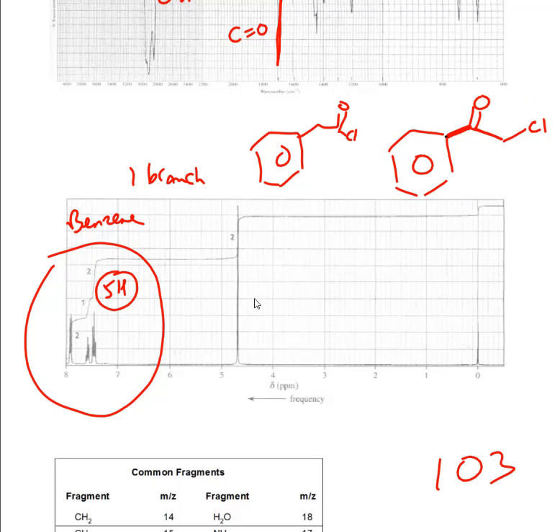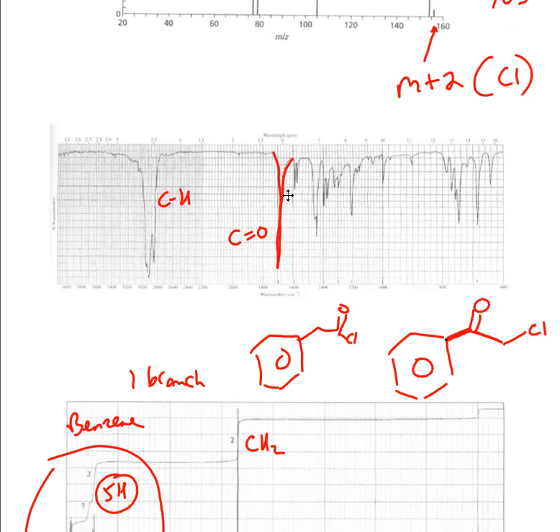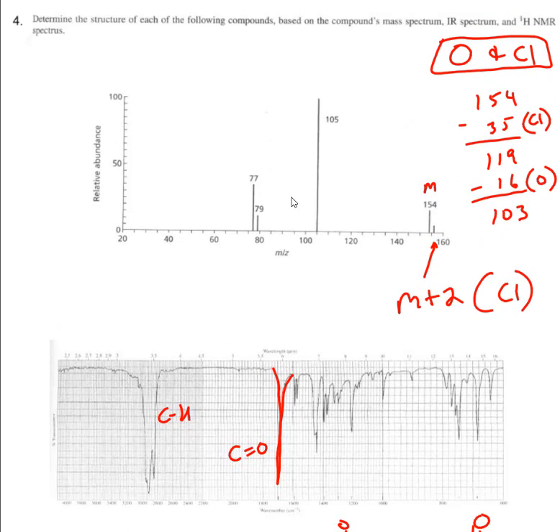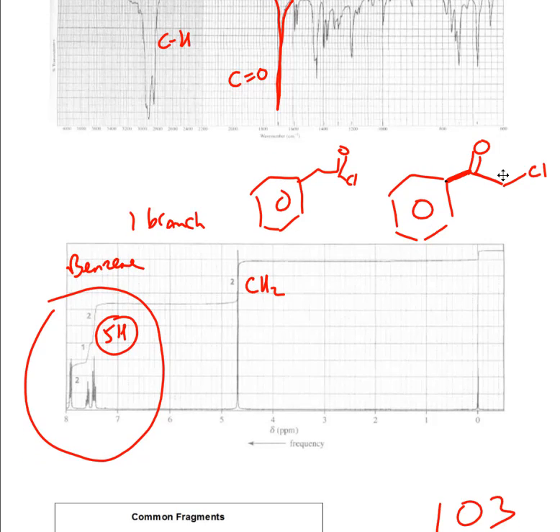Well, it says 2 H's, right? This is a CH2. And we have that here, and we also have that here. So that's not going to help us. So it could actually be one of these 2, and I'm not sure if it's clear which one it would be. Let's see. Nothing from here. Well, I guess fragment will help us. Yeah, definitely fragment will help us. Because remember, if you want to fragment the carbonyl, you're not going to break it on a double. Remember, okay, so let's kind of dig into this.